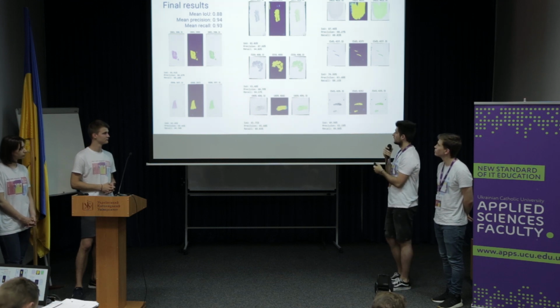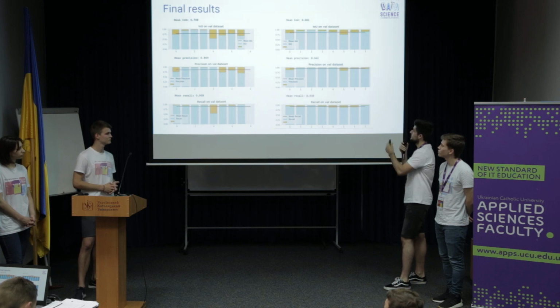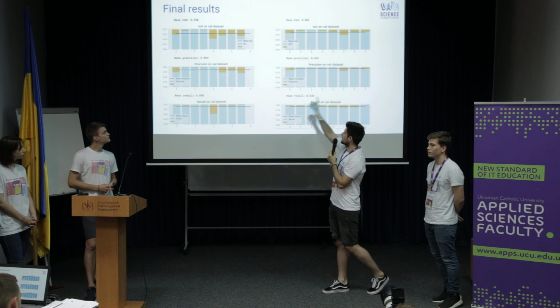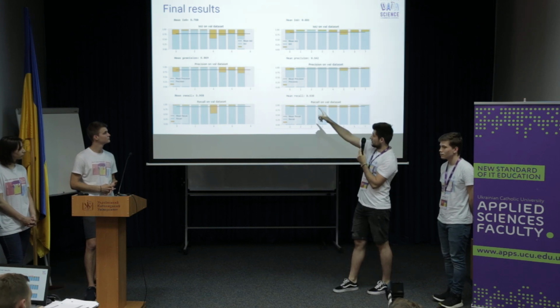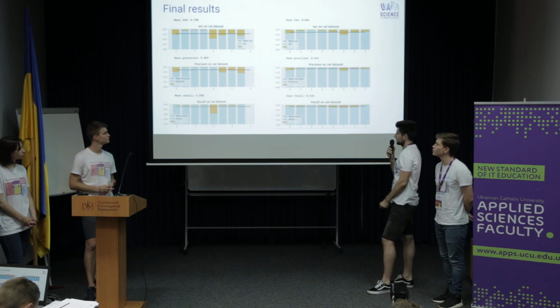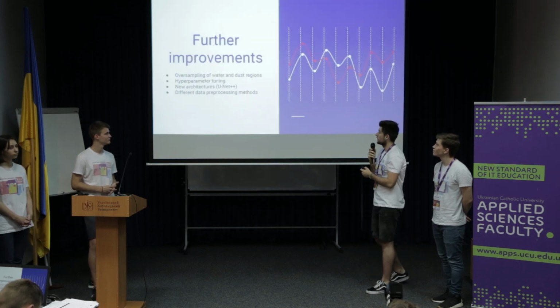So here is a quick bar plot to see the differences. You can see this is the baseline model, this is the final model, and mainly on pictures 4 and 5, you can see our misclassified ratio changed considerably in the final model.